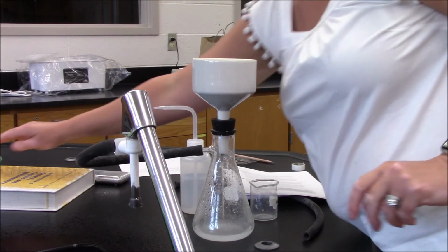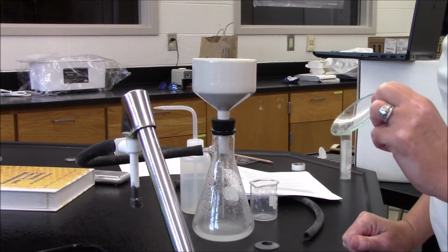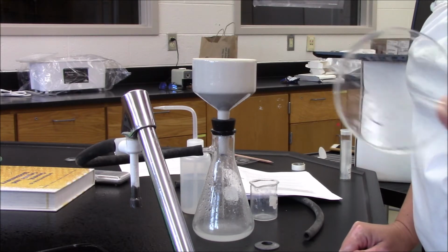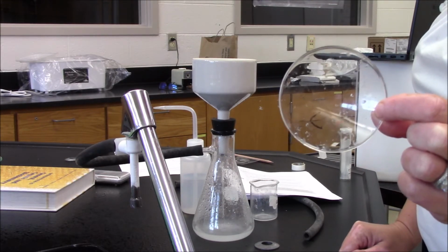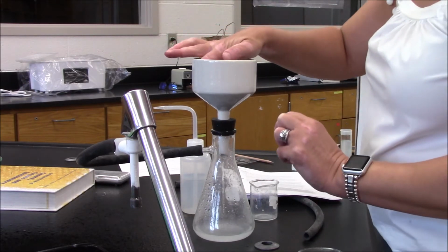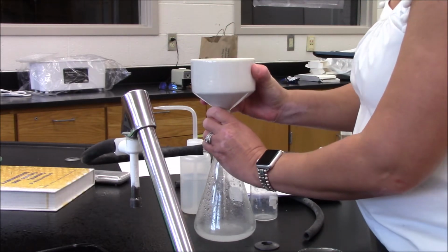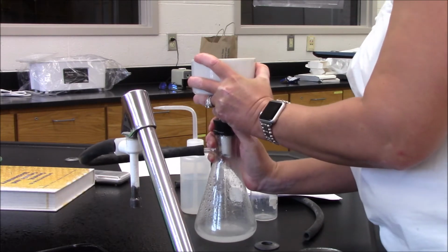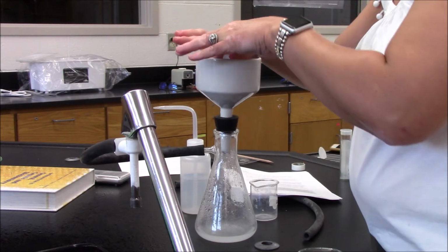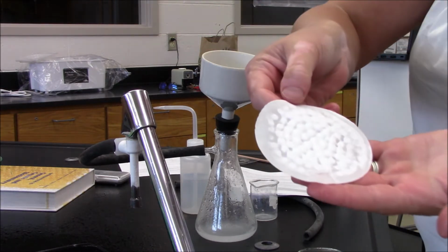I take a clean, dry watch glass. It's not dry. I'm going to have to dry it. I would write my name on it if I was in a lab group, but because it's just me, I'm not. I will carefully remove the filter paper. Release some of the suction to make it easier. There we go. There's my precipitate.